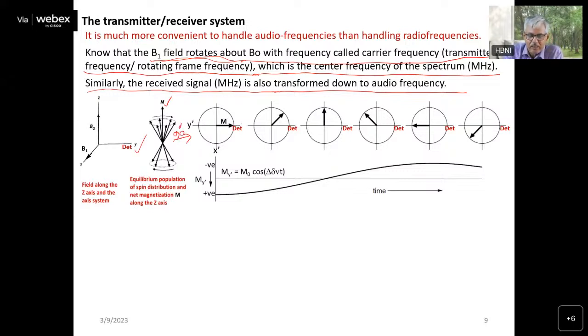It brings the magnetization M onto the y-axis where the detector is placed, so it sends a signal, and you get a current or voltage. As I told you, in the rotating frame we detect the signal as offsets. If this is an on-resonance pulse, M is not moving anywhere. It will slowly decay, with its magnitude decaying along the y-axis only, due to T1 and T2 relaxation.